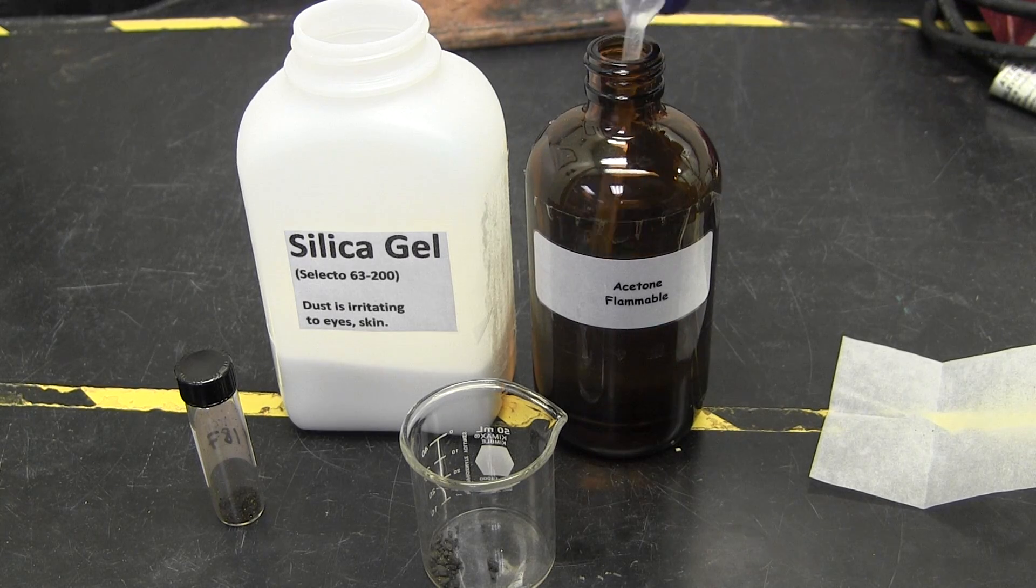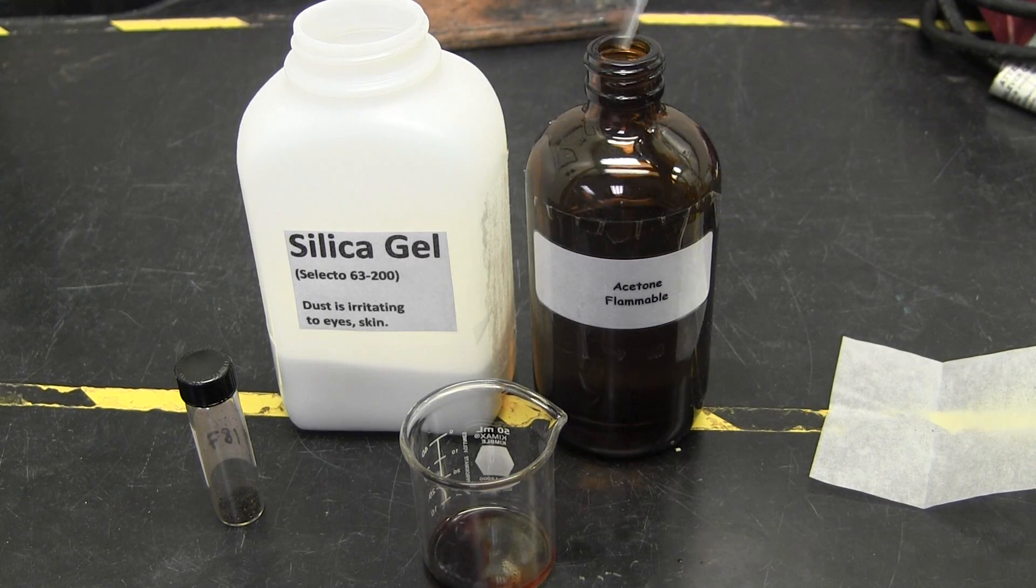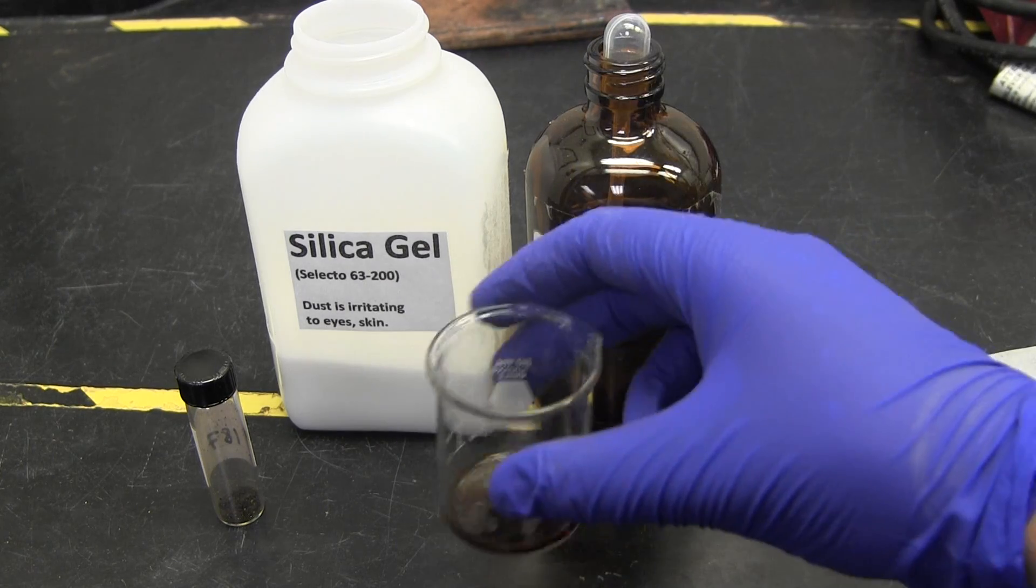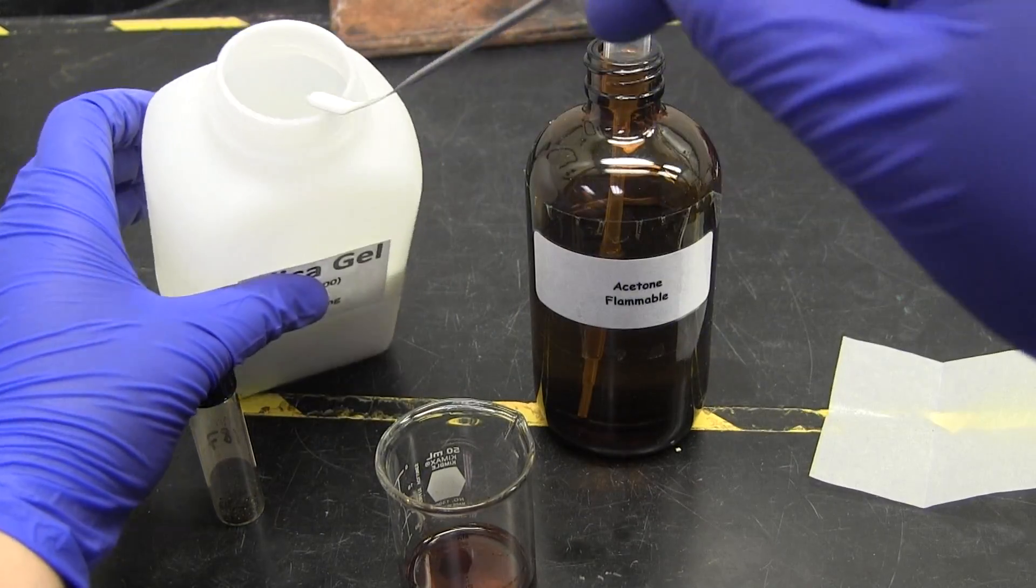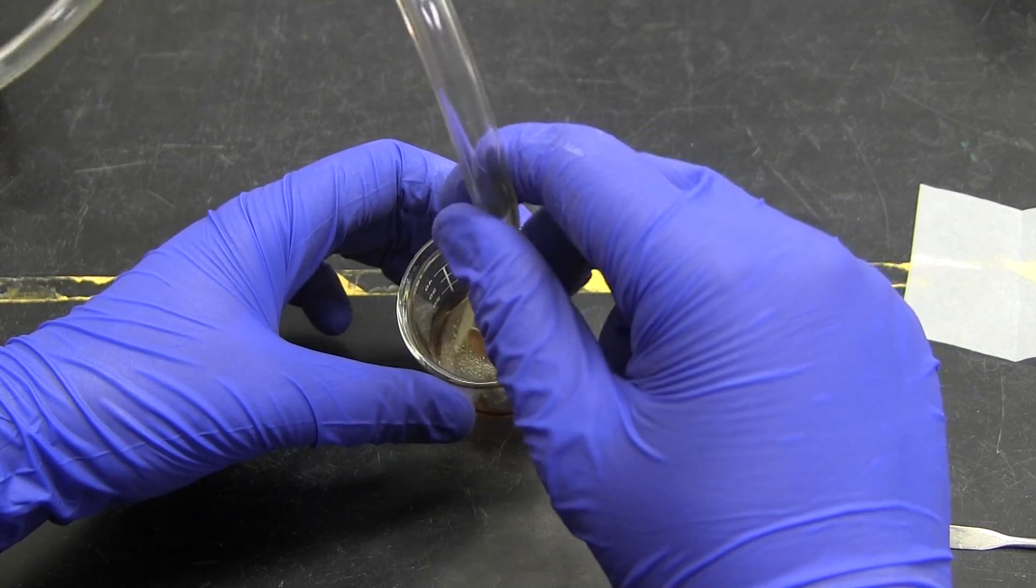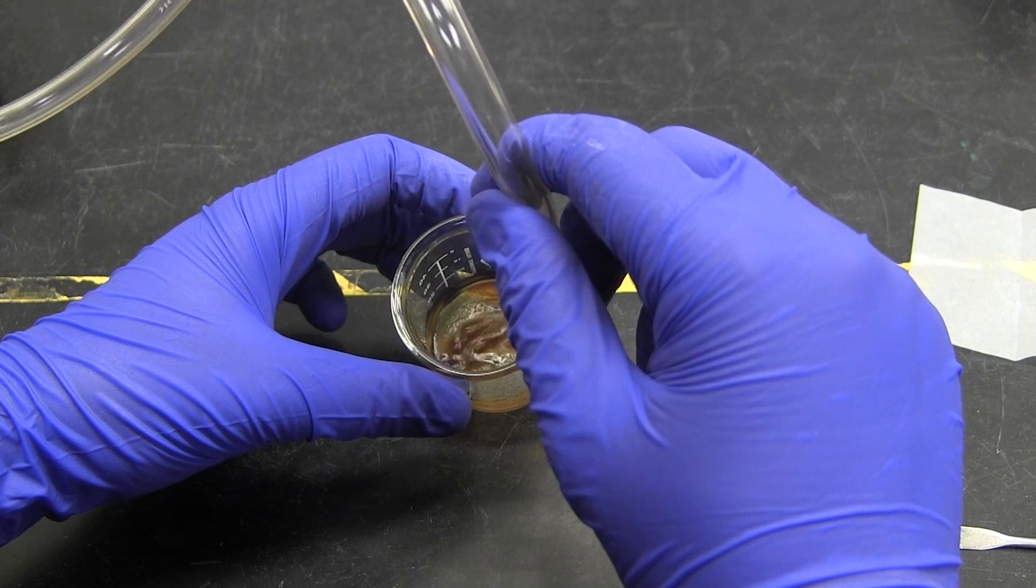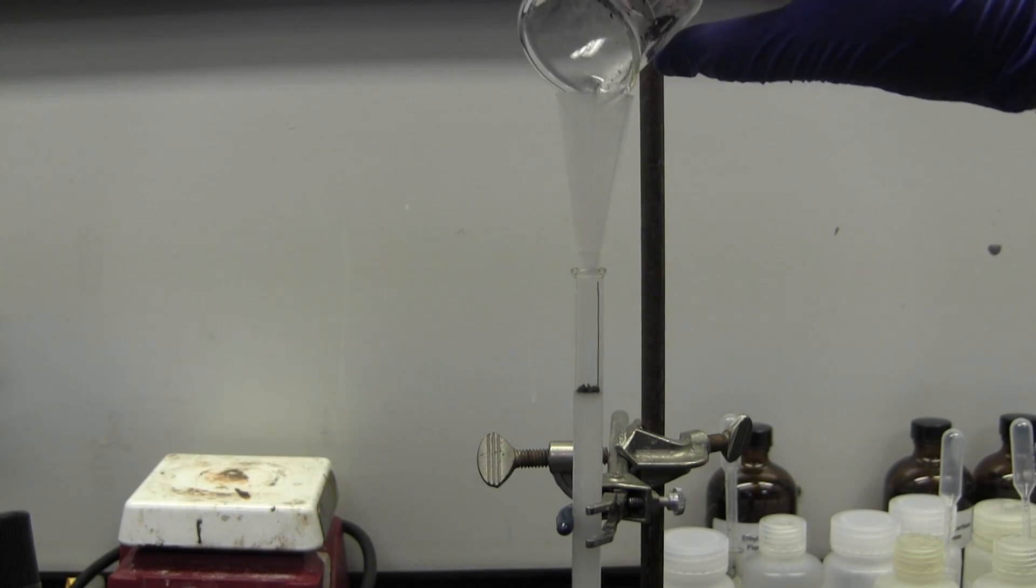Next, use the dry method procedure to load your sample onto your packed column. Do this by dissolving your unknown in a small amount of acetone. Mix this with a small scoop of dry silica gel and dry completely with nitrogen. Remember to evaporate with nitrogen gently or you will lose your unknown. Scrape this out of your beaker and add it to the top of your packed column.